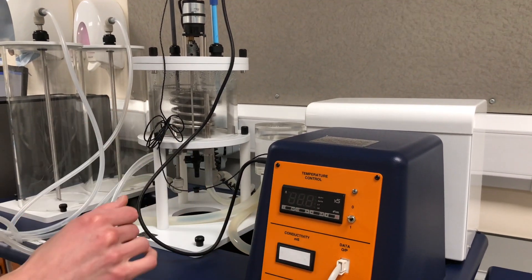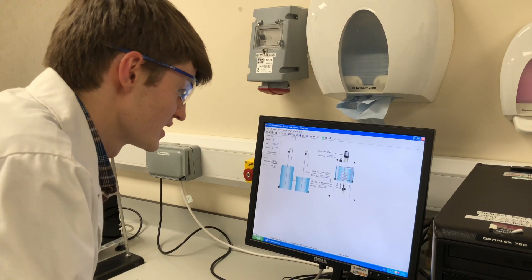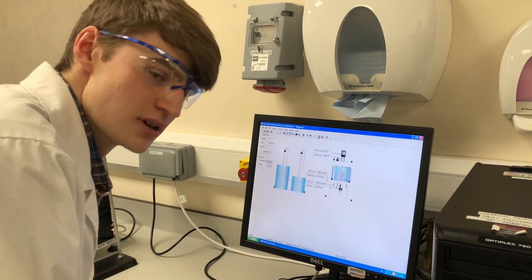Once you're ready to begin the experiment, you click go. And that's you all set.